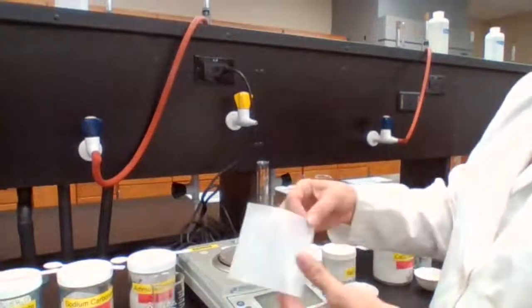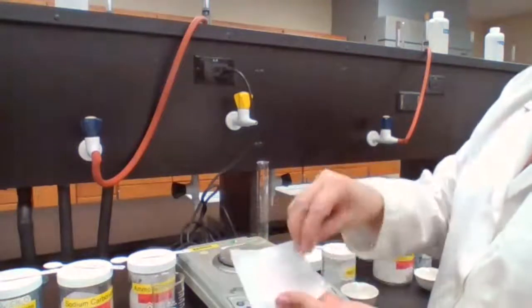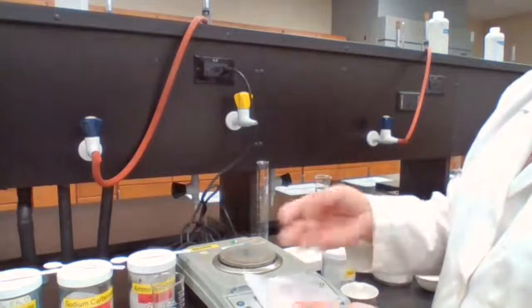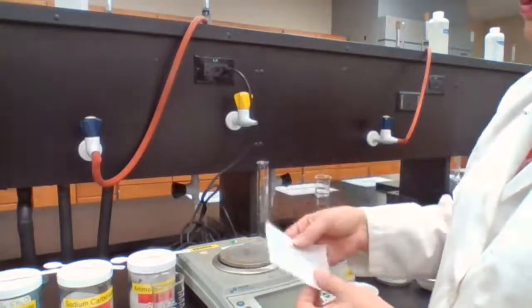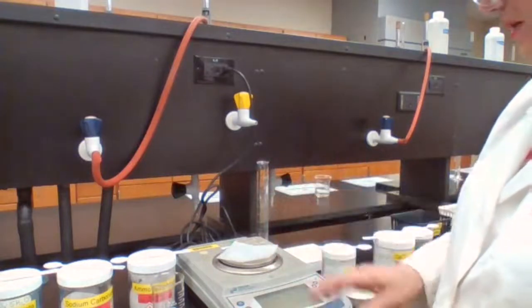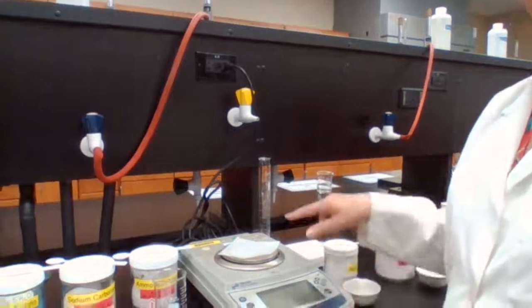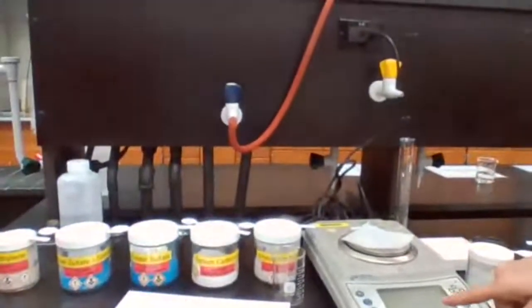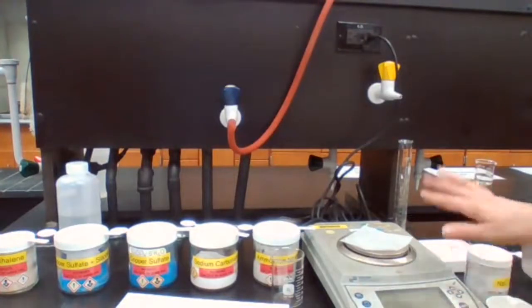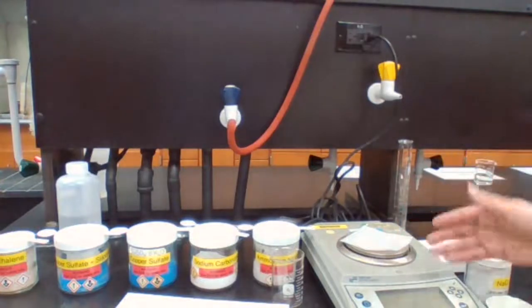Weighing paper is like a shiny paper with no pores, so that when you put the chemical on, it would not be left behind when you're trying to transfer. So it should be inactive. It should not react with the chemical, and so transferring would be easier. The weighing paper has the mass of 0.4. We don't need that at this point because we are not doing by difference. We're just using this as an indirect measurement, so we're not putting the sample directly on the balance pan.